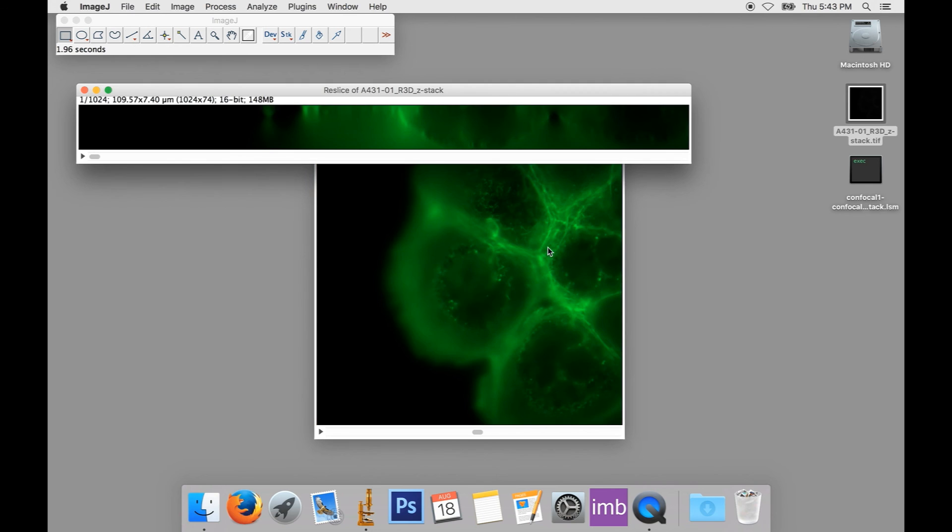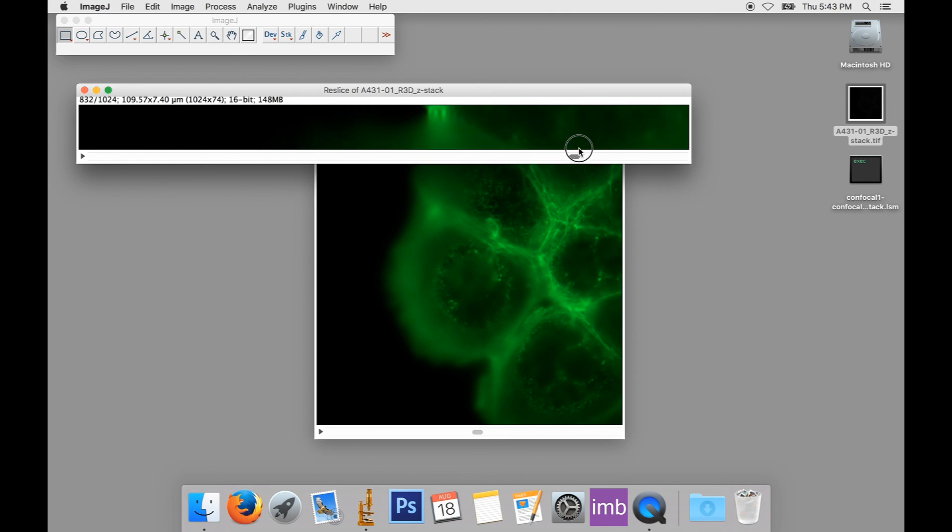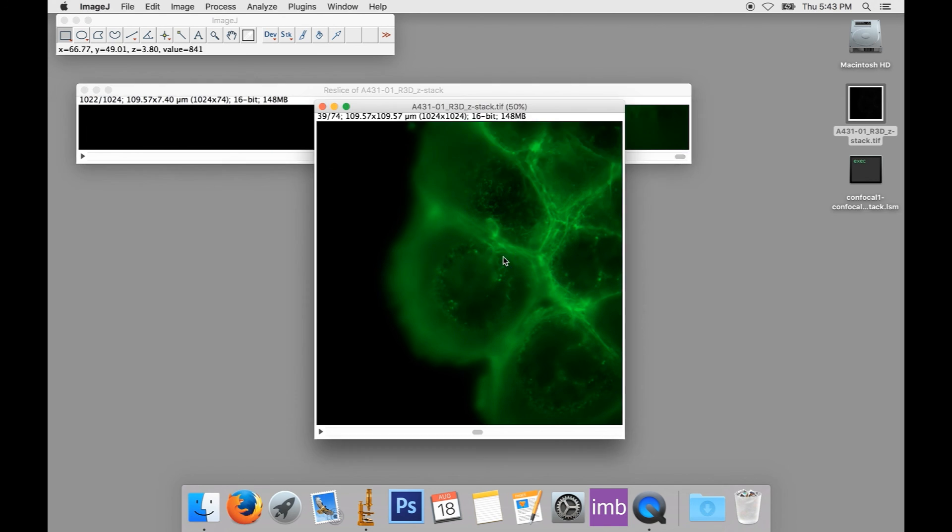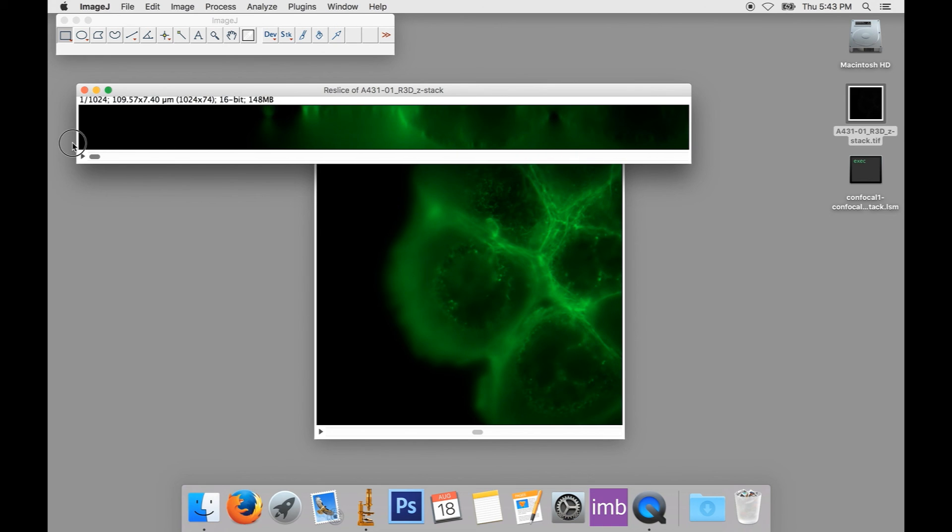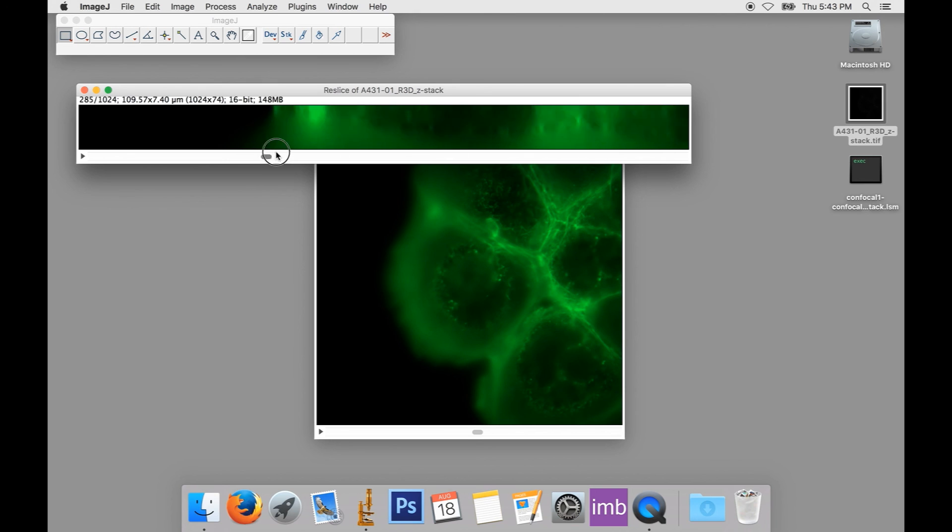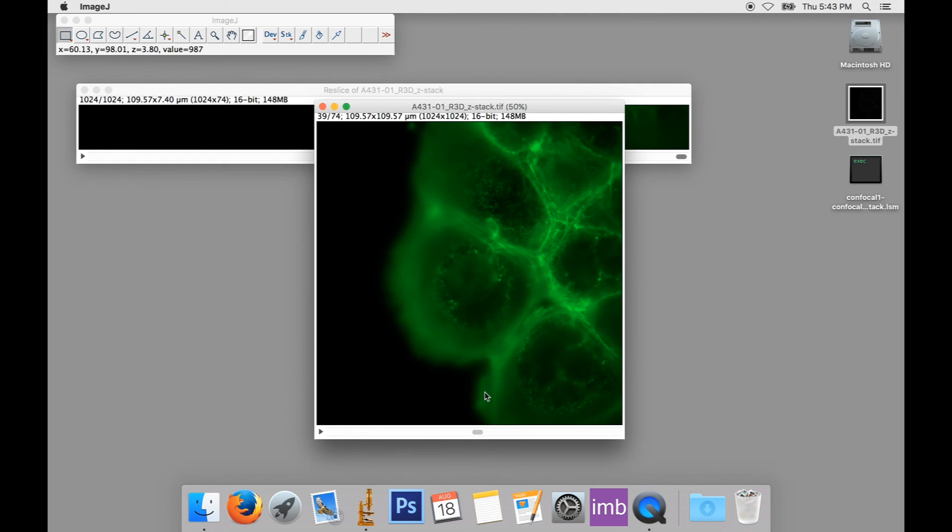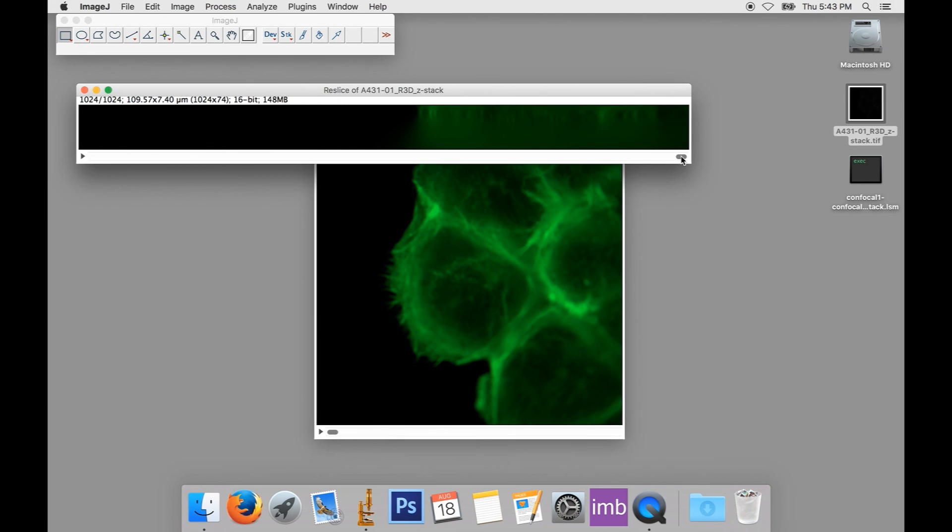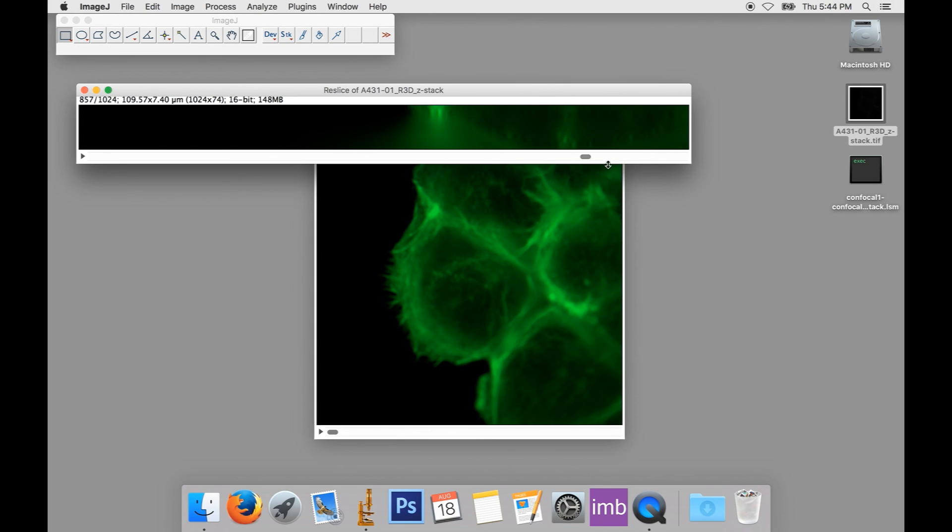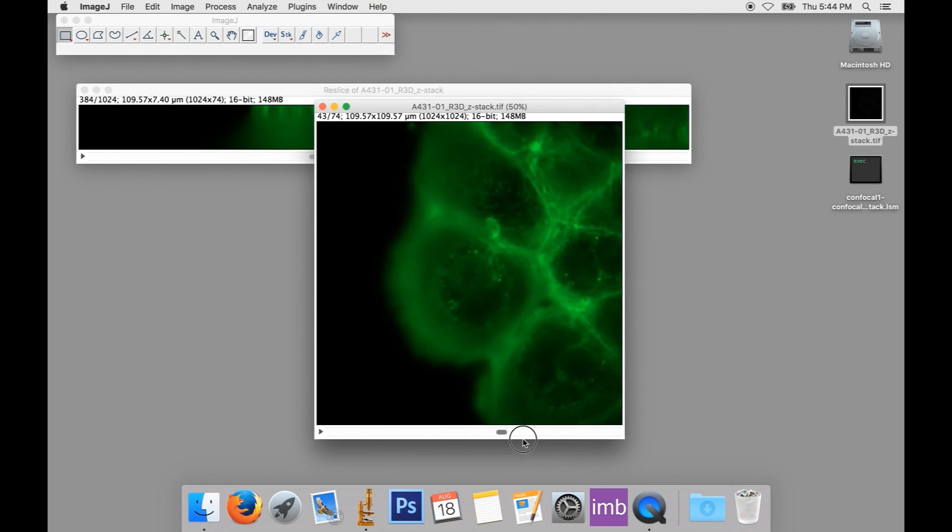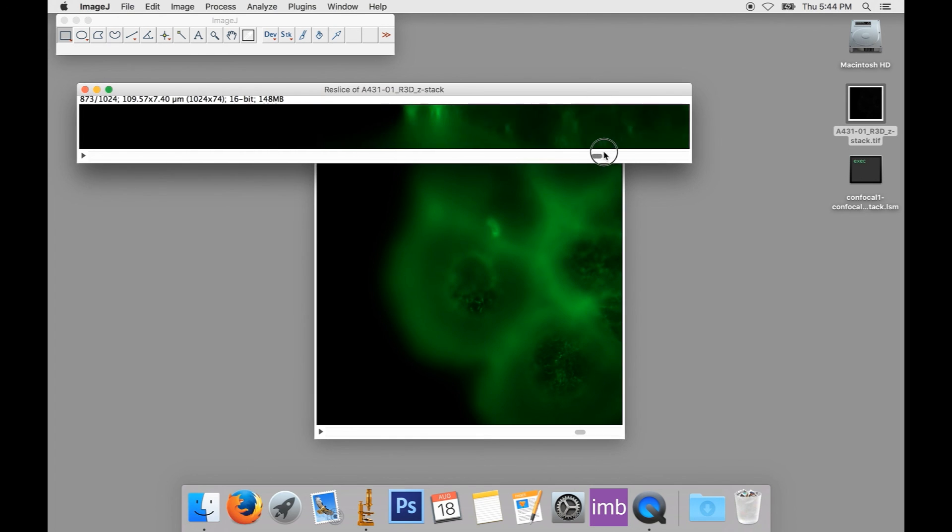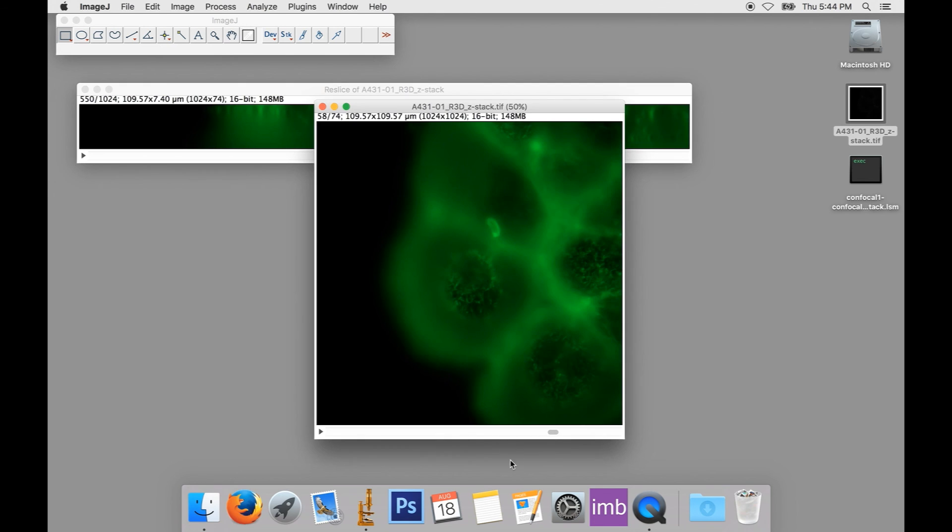And now I can scroll through my image basically from the top of this image—so the most positive Y, the largest Y here, down to the smallest Y here. The bottom of my stack seems to be the top of this stack, and the top of this stack is the bottom down here.